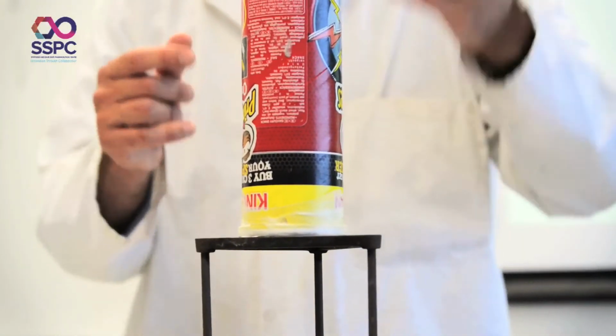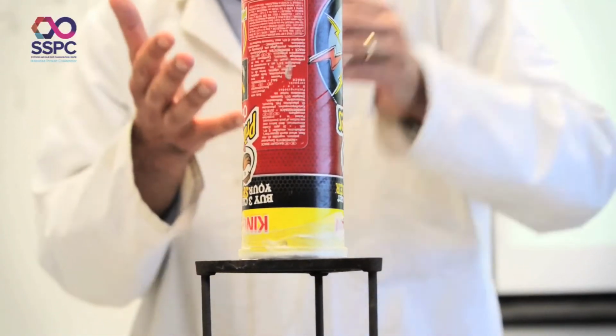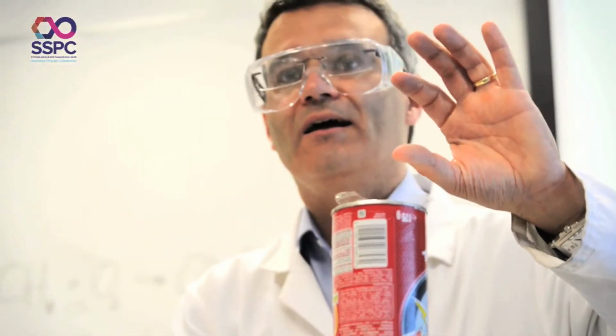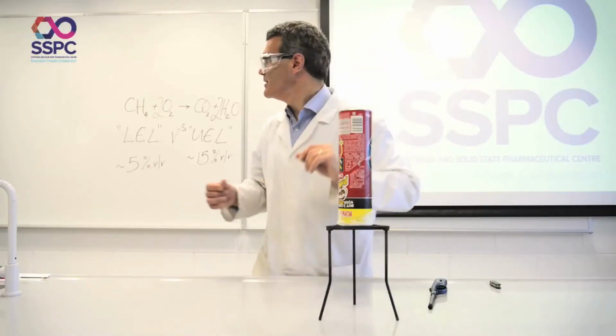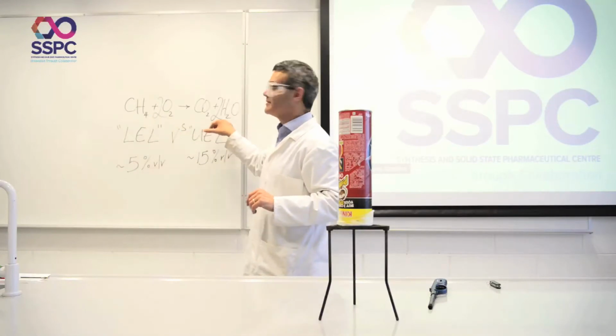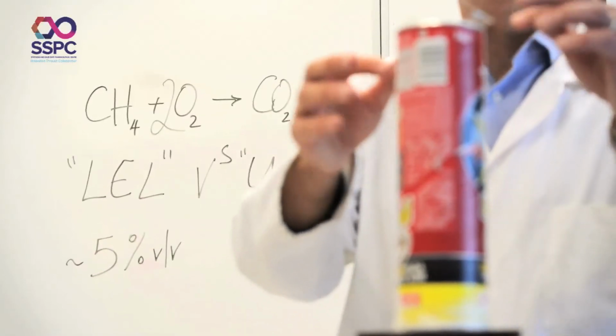When you light it, what you'll see is, because methane is lighter than air, and as I said, it's important that it's methane because it is lighter than air, it will rise and it'll light. You get a yellow flame, typical of a candle or a Bunsen burner that's burning inefficiently. So you'll have inefficient combustion first. You'll be burning away methane in oxygen, giving you carbon dioxide and water. The air is coming in the bottom and replacing whatever methane has been removed.